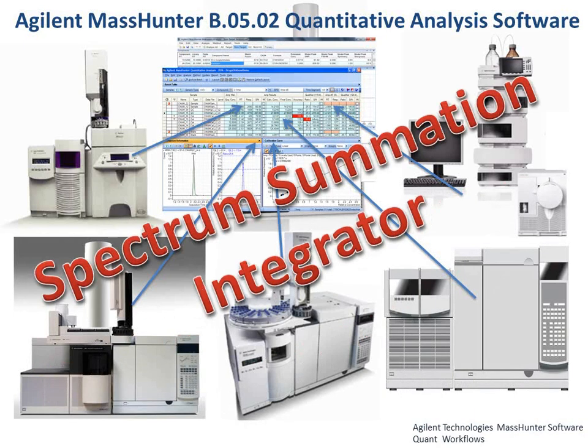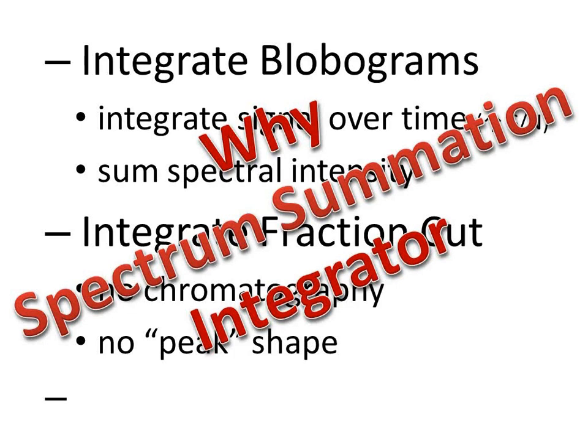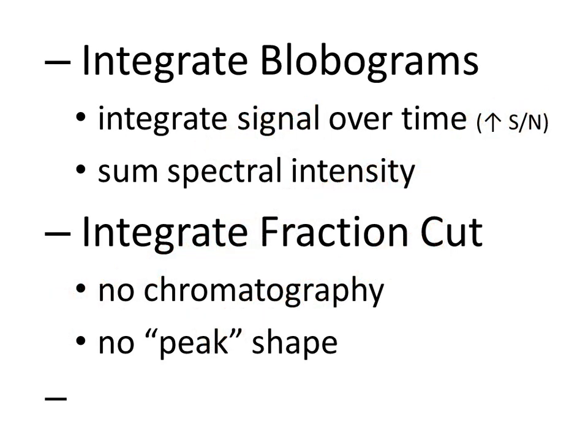Welcome to the Spectrum Summation Integrator. The Spectrum Summation Integrator is useful in a specific case where you have no chromatography or poor chromatography. And this is sometimes referred to as integrating a blobogram.